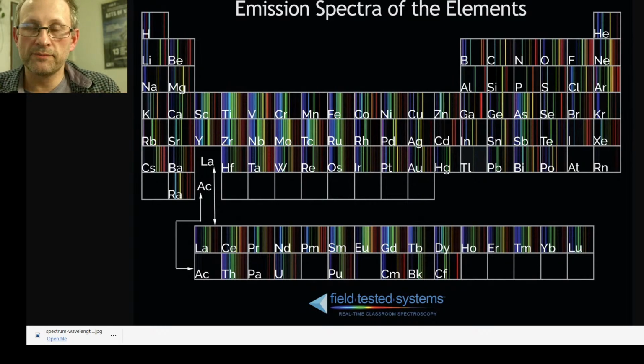And we saw elements that one might expect from George Osawa, the guy that did the original work, sparking carbon rods together with a high current and then seeing production of elements, sometimes underwater. It's these Osawa reaction chains. If we're seeing it also in the spectral output, this is another data point.